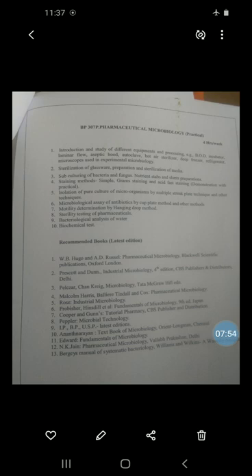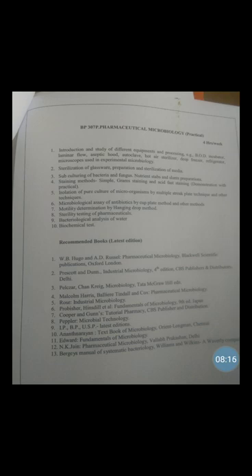So this is all about the principle. Next, the observations and result. The colonies appearing in Petri plate A are not distinct, small and overlap with one another. Then in Petri plate B, the colonies are large, discrete and generally do not mix with other colonies. And in Petri plate C, the colonies are larger and isolated colonies with distinct shape, color, texture, size and form are observed.